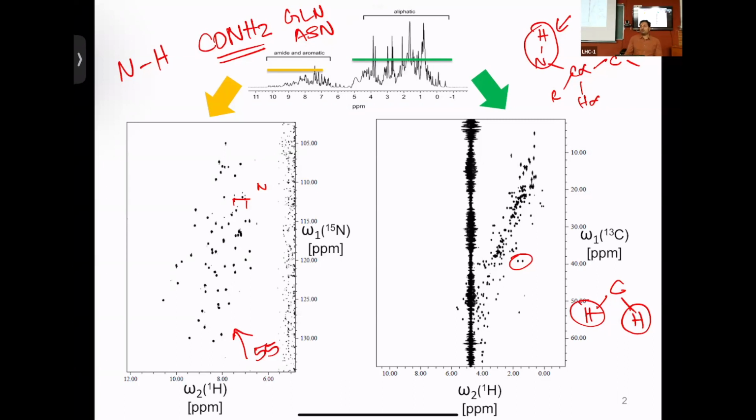So slowly, we have started to appreciate that we will be able to take the NH spectrum and the CH spectrum, but the NH spectrum is what is acquired most commonly, also because 15N labeling is relatively cheap compared to carbon-13 labeling for proteins. So when people prepare their proteins, by default they'll do 15N labeling. And therefore, are they sure whether they made the right protein?